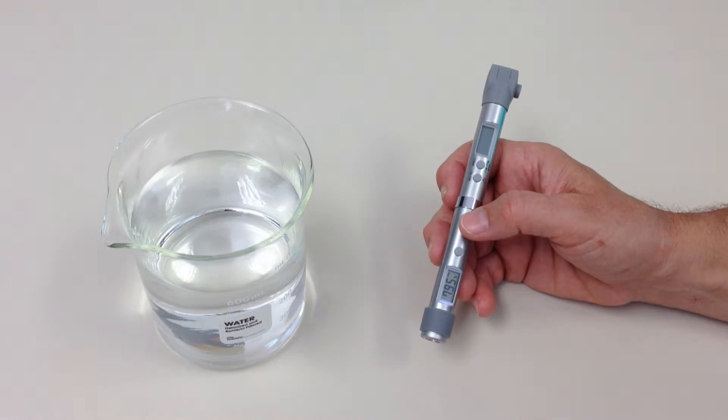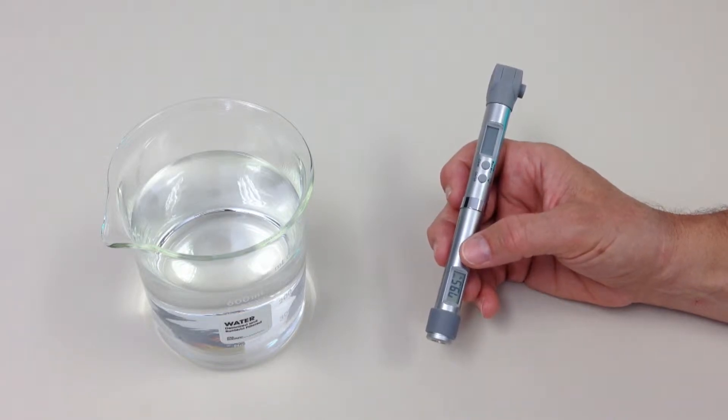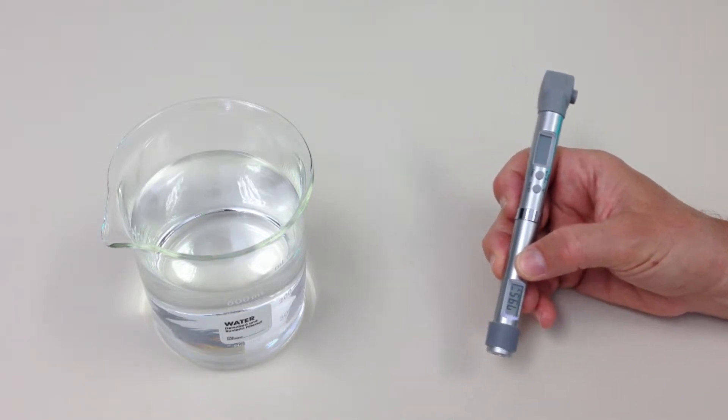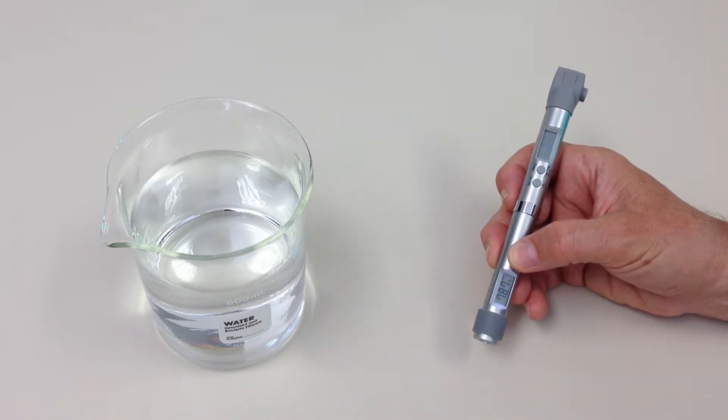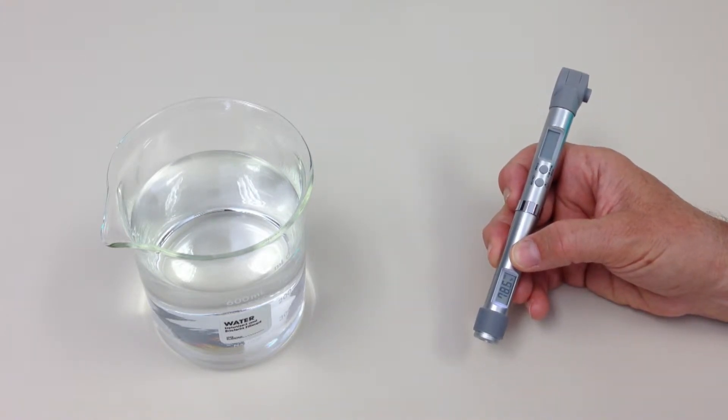For surface temperature measurements, one end of the sturdy metal pen contains a non-contact infrared thermometer. Press the button to scan and release to hold temperature. IR results are displayed immediately on the backlit LCD.